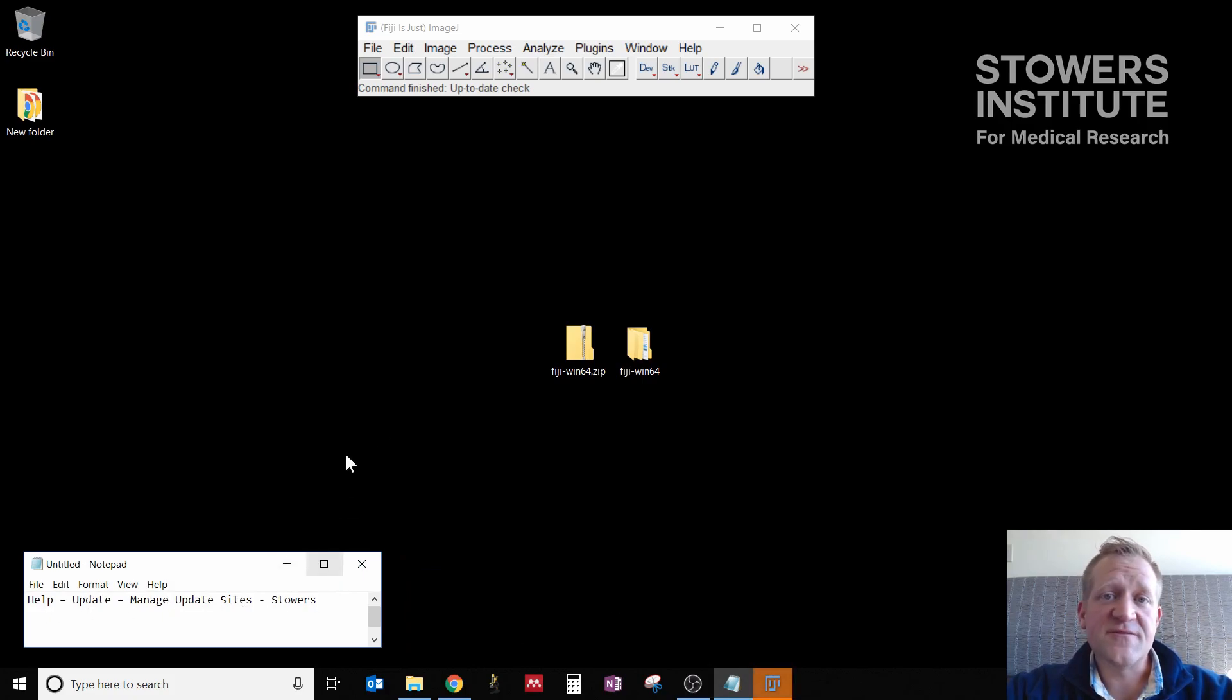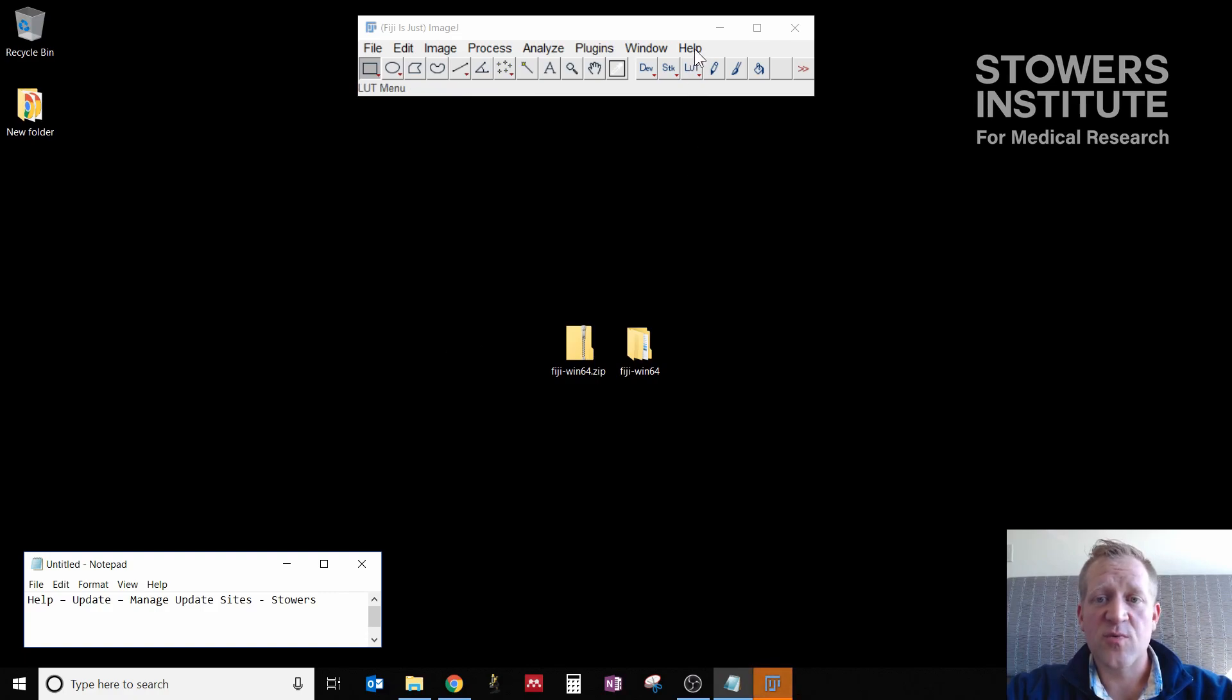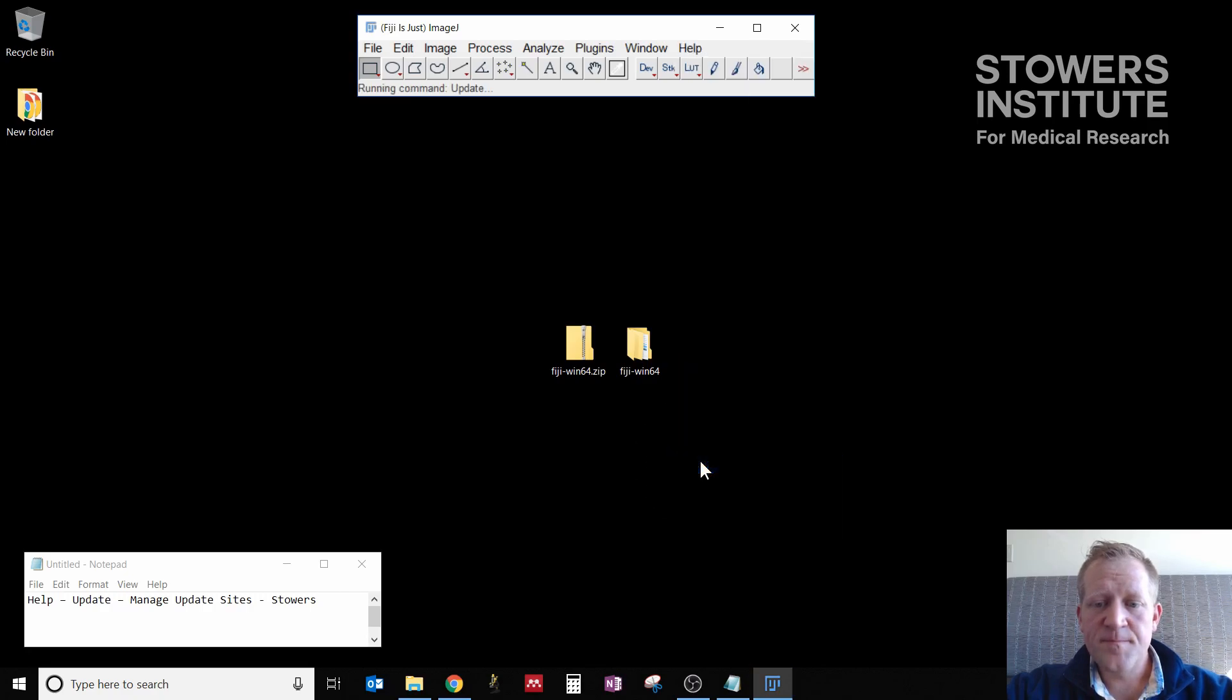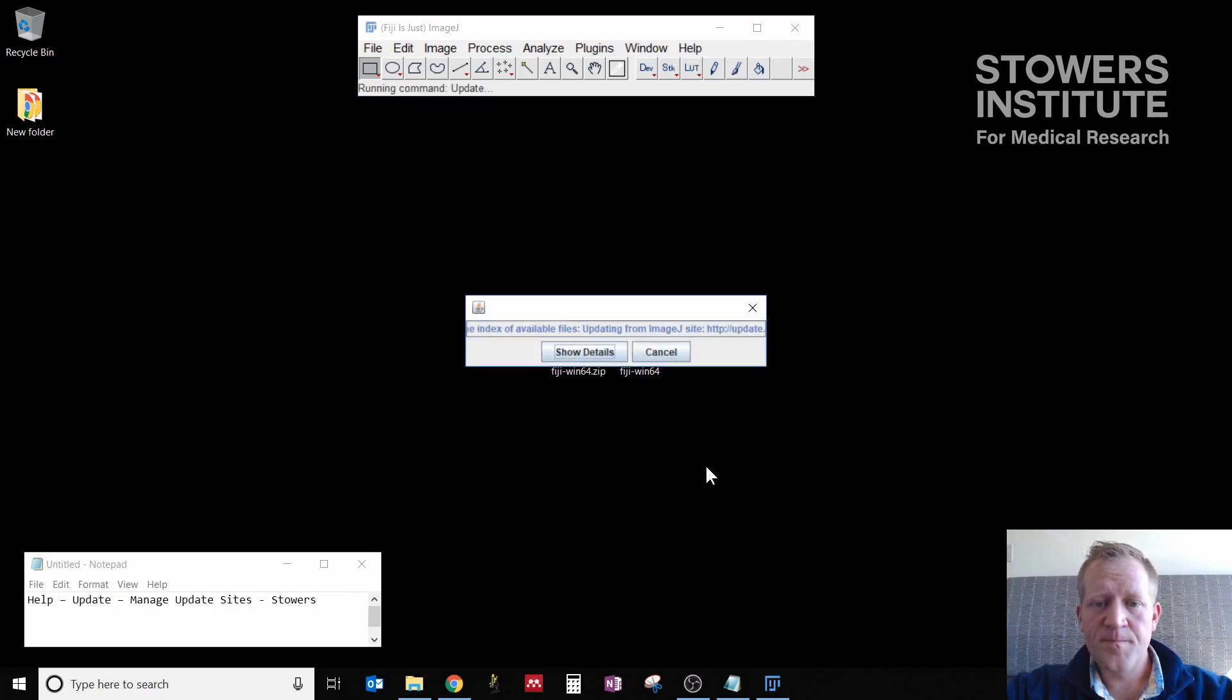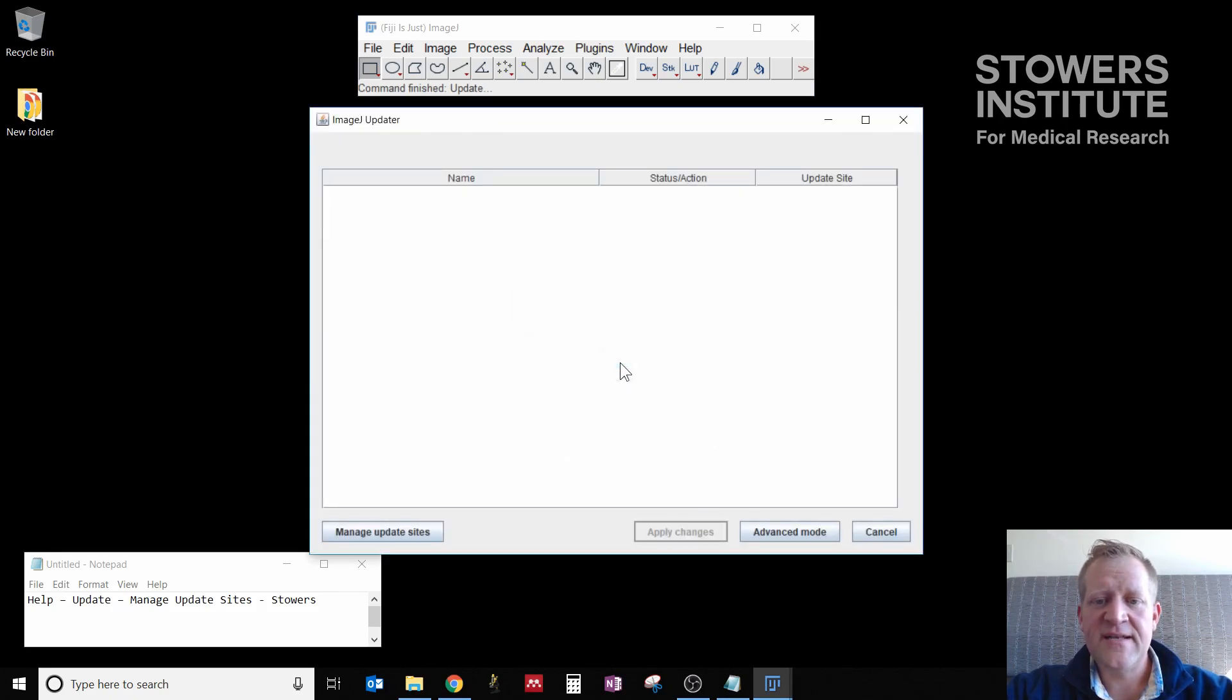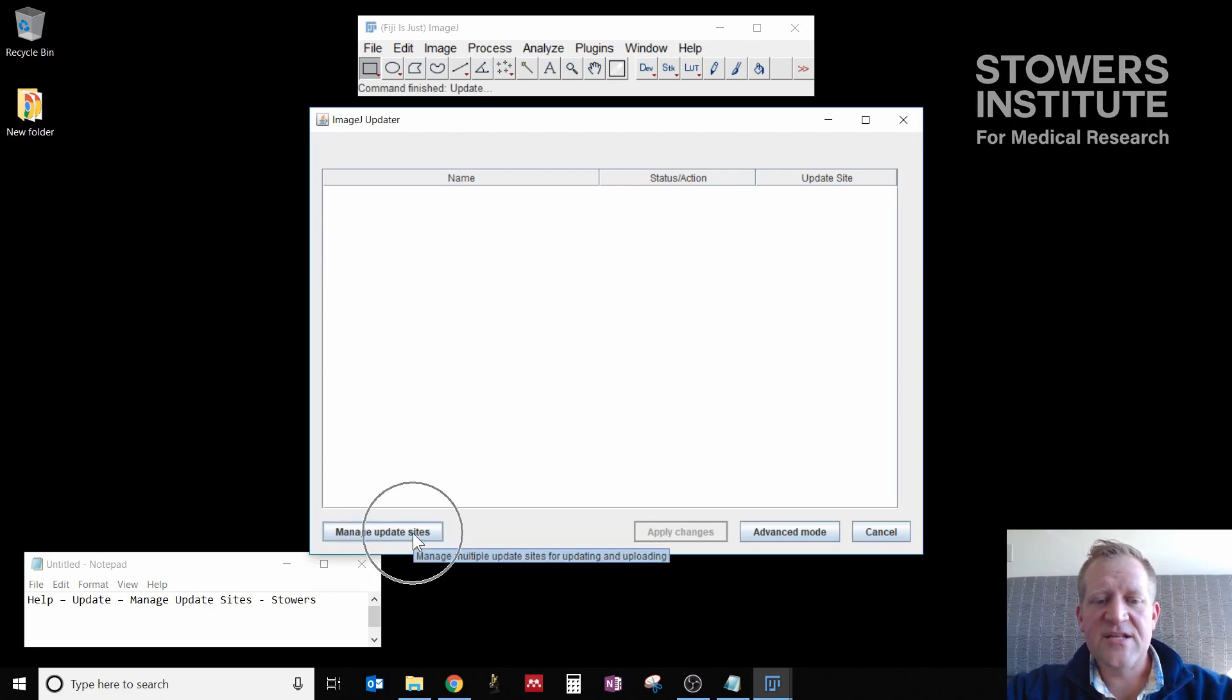So this is where all of the updates for Fiji are hosted, not only from Stowers but from across the world. We'll read from a series of websites for updates. It might say right now I'm up to date, so that's fine.